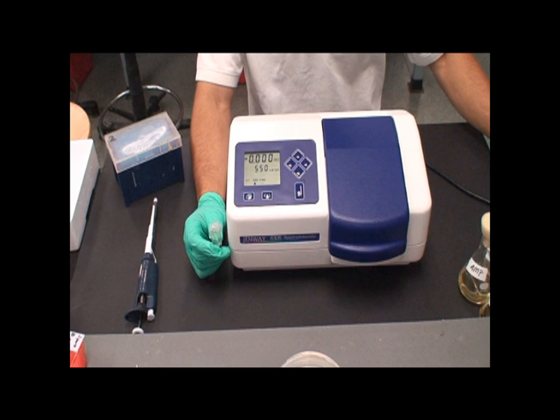If unfamiliar with the proper use and function of a spectrophotometer, review the video, How to Use a Spectrophotometer.